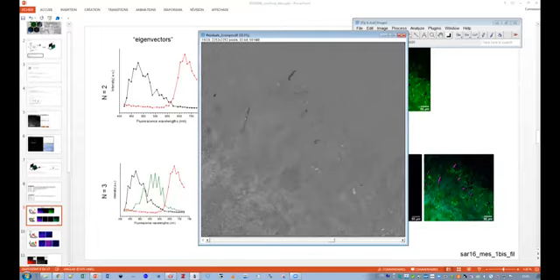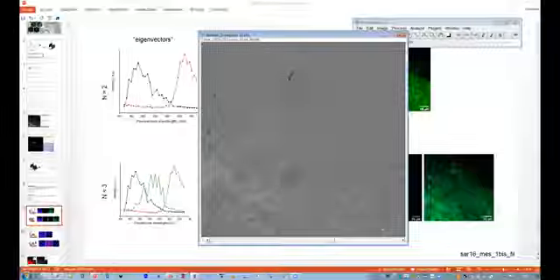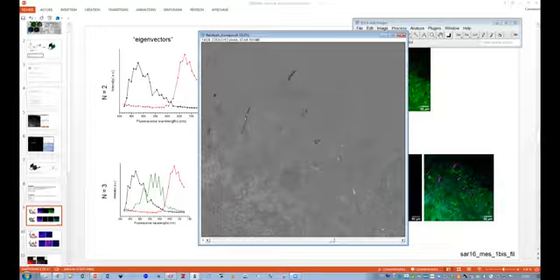So I say to myself that maybe there is another eigenvalue, but I don't have the weight of each eigenvector. You are expecting the weight percent of the contribution of each eigenvector? Yeah, I don't have them. So you have to try some combination. Okay.